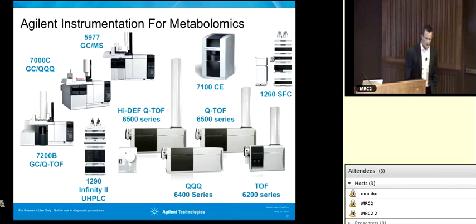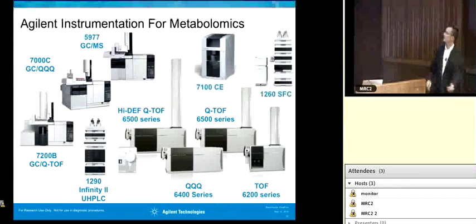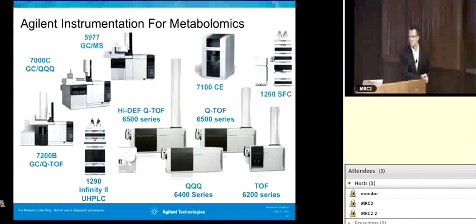So I want to talk a little bit about ProFinder now. And as I mentioned, Maureen will discuss the untargeted side of the fence, and I'm going to discuss the targeted side as it applies to fluxomics. ProFinder was released about 2 years ago as a batch processing utility that allows us to do many data files simultaneously. It is now multi-threaded, so we can take advantage of multi-core PCs, and we can process up to about 500 QTOF data files at a time. So we can chuck them up, go have our coffee time, and come back, and we'll have data that's been extracted for us.